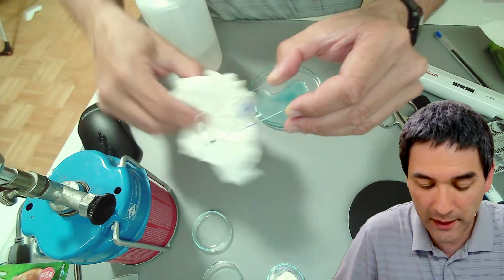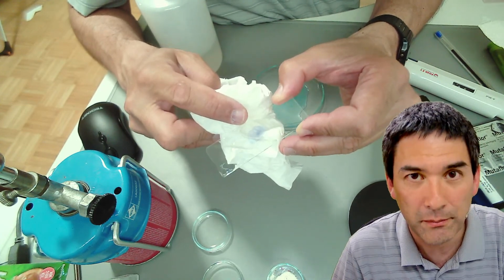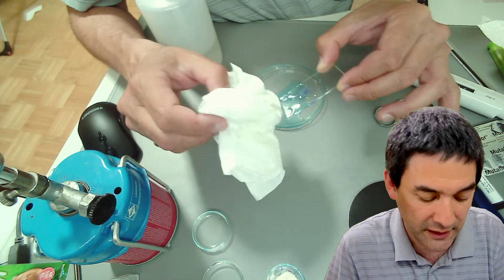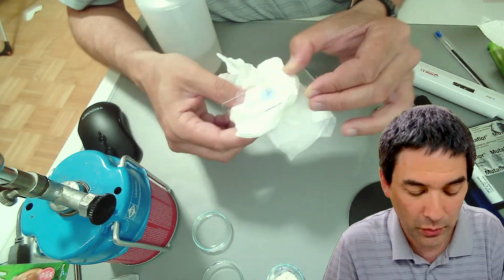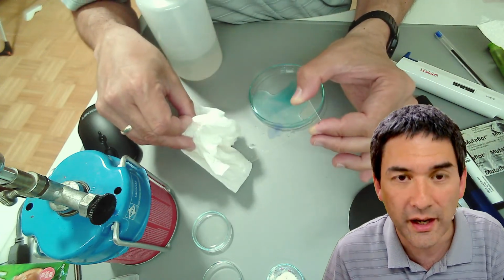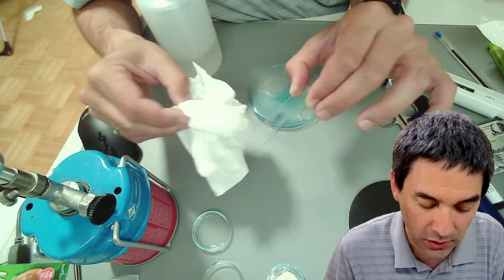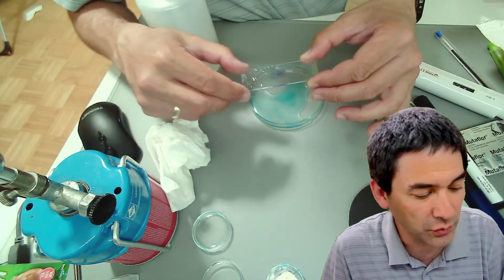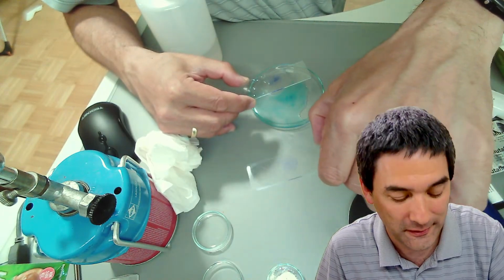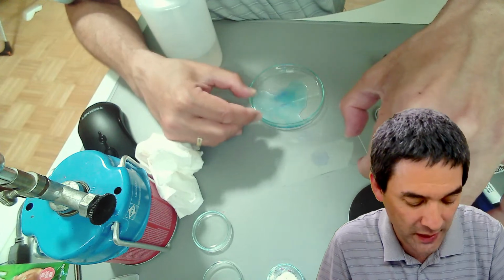Let's use a white background. You see, actually it stays blue, because the bacterial cells have been stained. And then what do you do now? You wait again until it's dry, a couple of minutes. Now, of course, we don't have time to do that because we're also impatient. And this is the reason why, as you have guessed, I prepared already a slide, and this one is now dry, so that we don't have to wait.